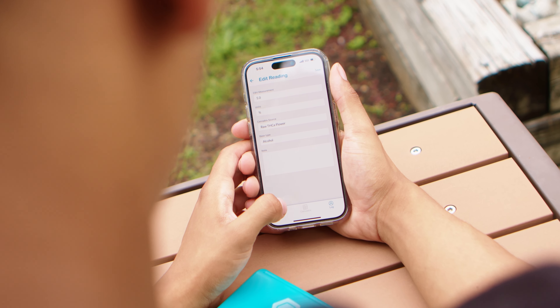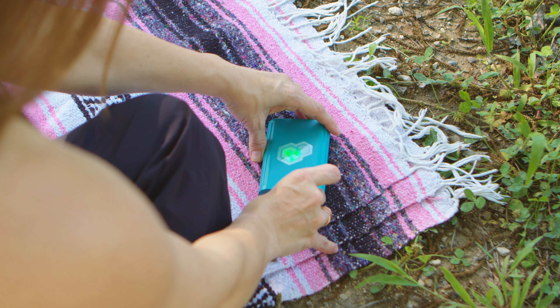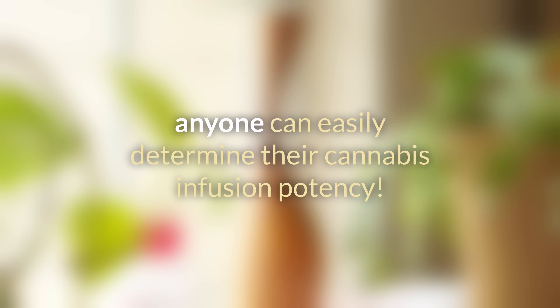Potency testing of your herbal infusion is a snap with T-Check. We've simplified the potency testing process to just three steps. Now users at any skill level can easily determine their cannabis infusion potency.